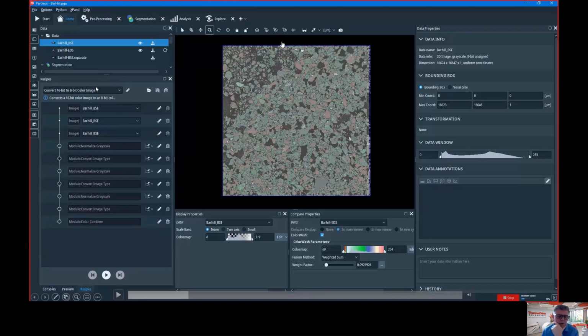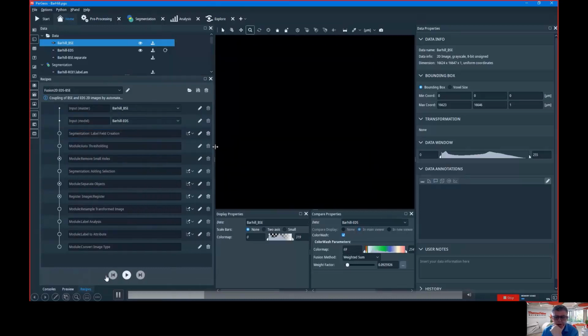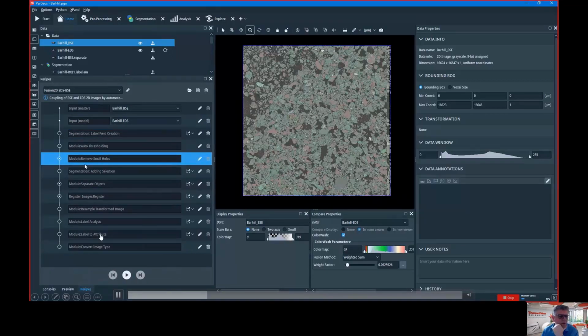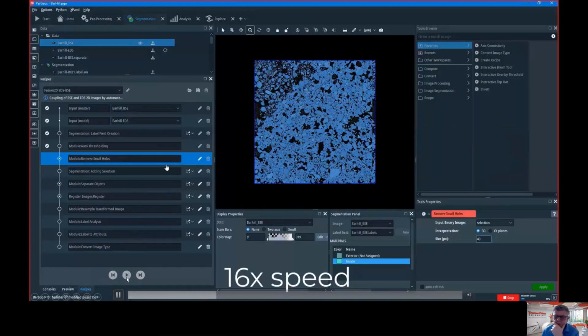Well, there is a recipe in PerGeos to do that. So I go to the recipe, and it's called Fusion EDS BSE. I give it the EDS, and I play the recipe, and you see the steps. Well, I'm not going to comment, it's a recipe. Yeah, why did I accelerate the video?